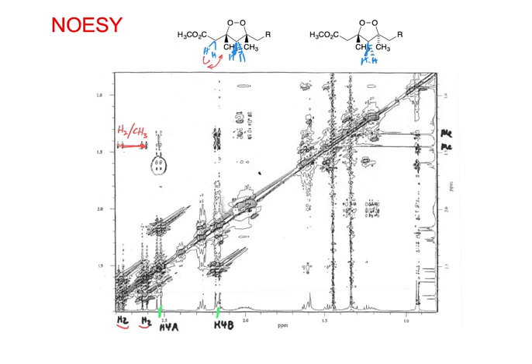If we go from this H4 up this way, notice this H4 is going to both of the methyl groups. Whereas this H4 over here doesn't have very much at all, right? But what it does show is that this H4, I think, is going to H4A to H6. So those are the ones that are on the other side of the ring.